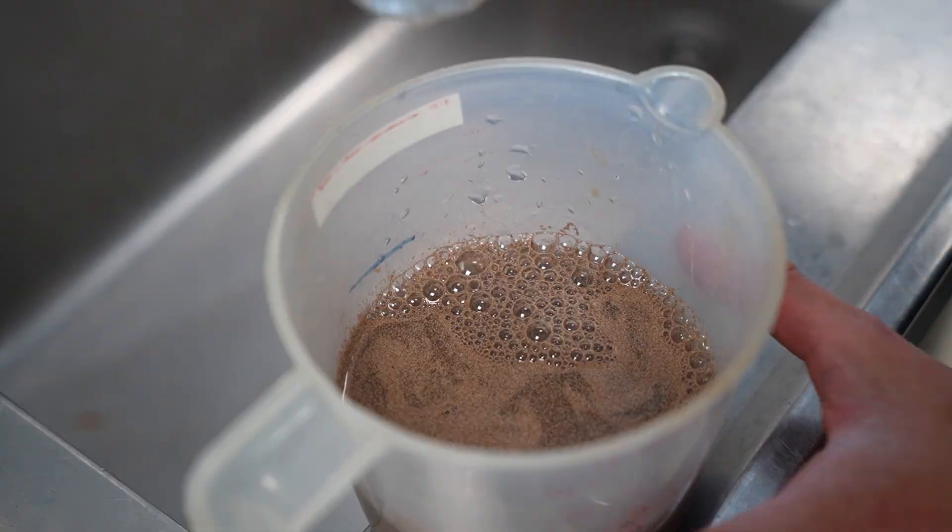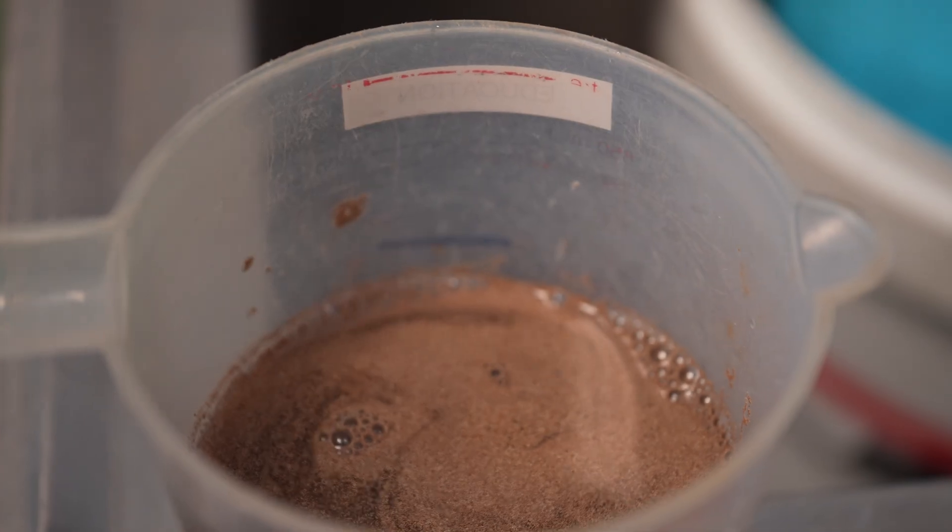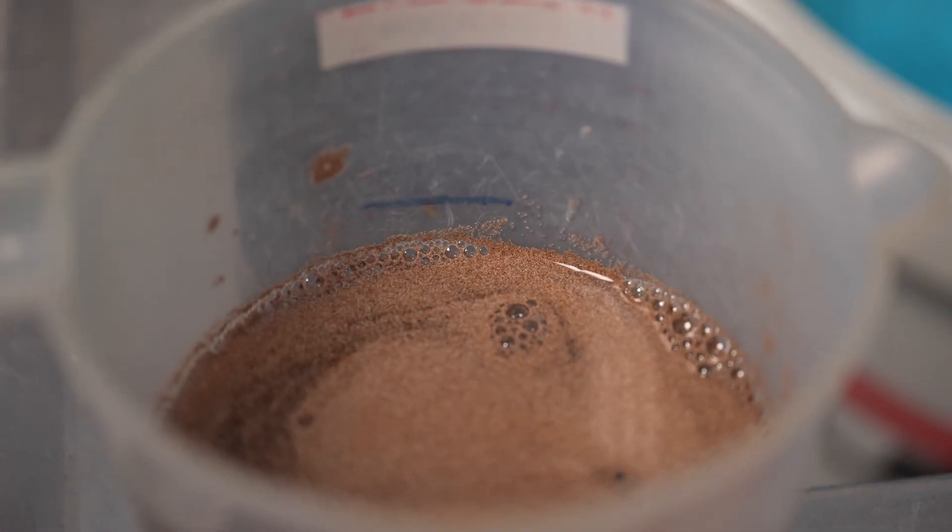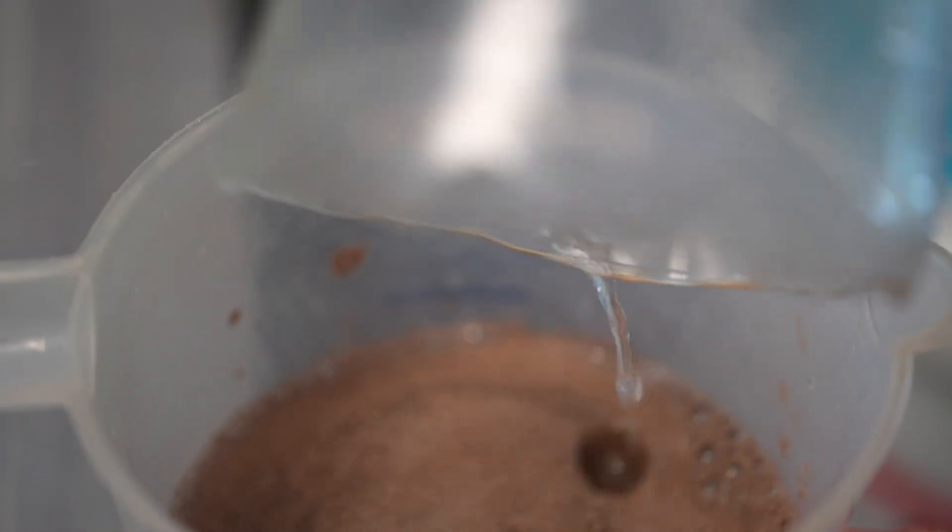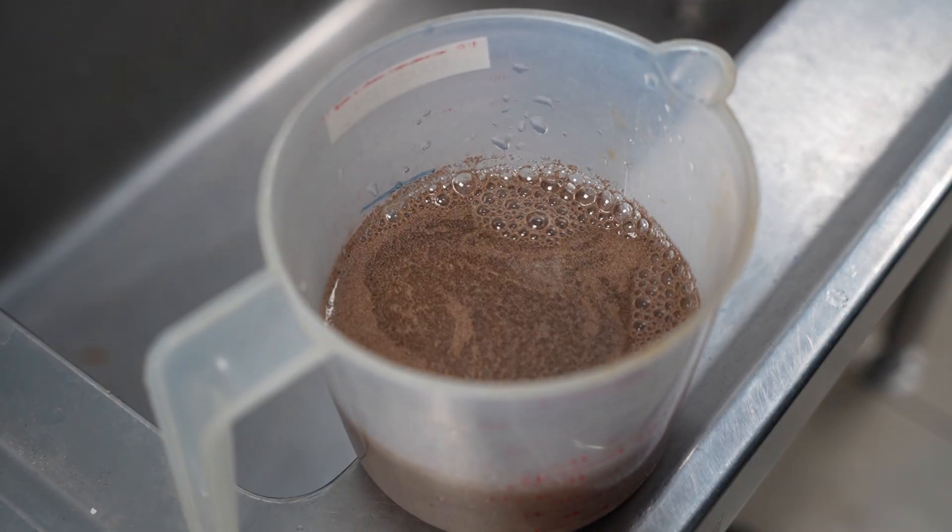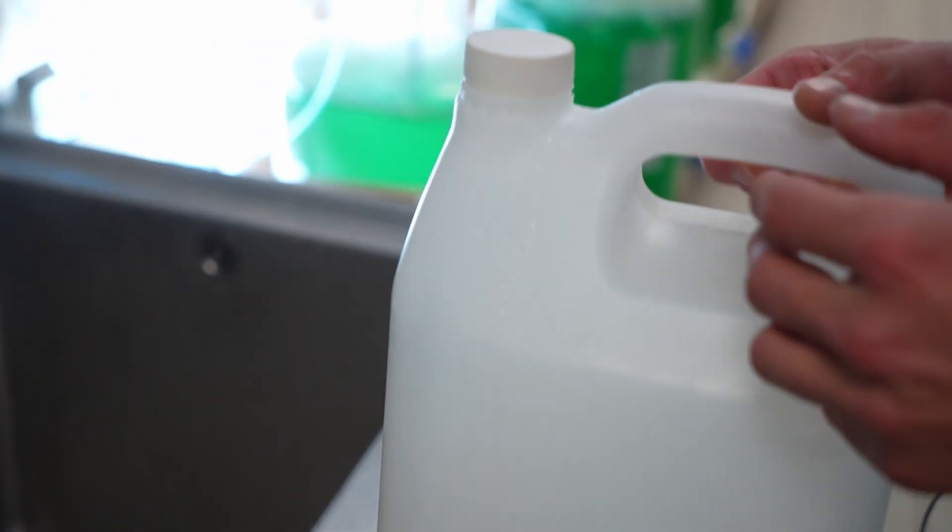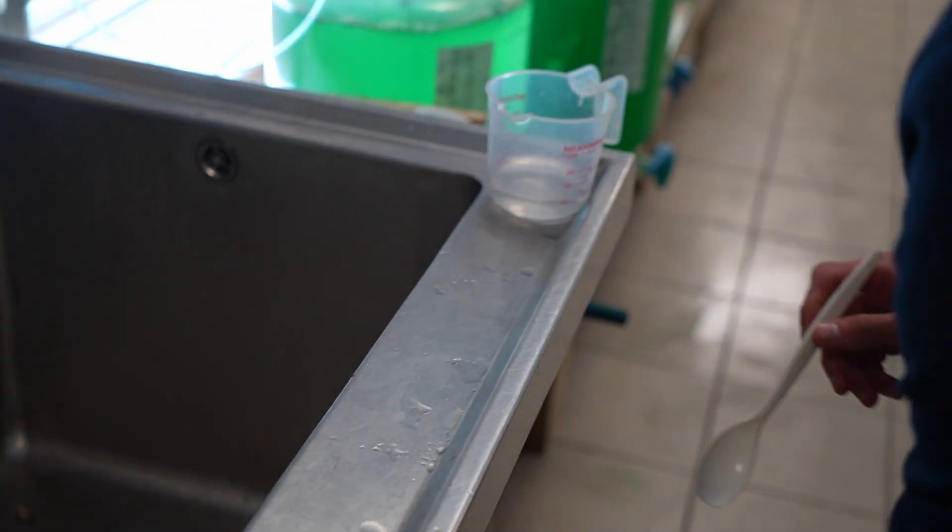Now I'm just using the water to wash off any of the eggs on the side and to get all the eggs up on the bottom. As much as we can, we don't want to waste any eggs. Now we've got our eggs in our jug. And then what we're going to do is we're going to use bleach. We're going to put bleach into the jug.